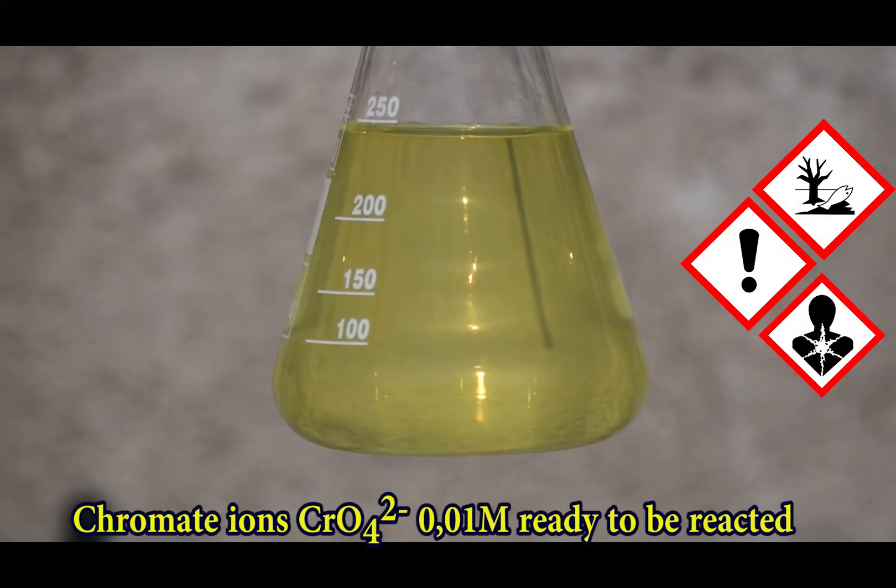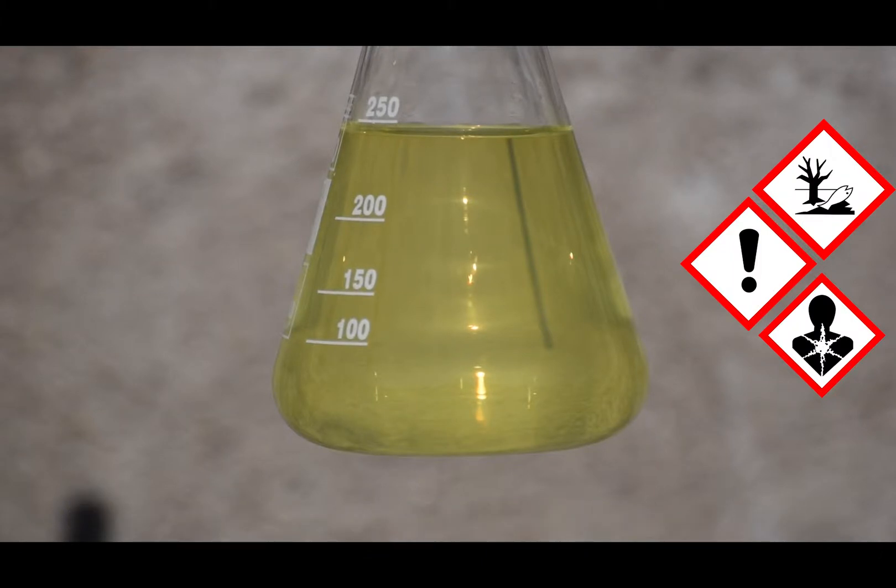It's enough to have a small concentration of chromate — for instance, 0.01 molar or 10 mmolar — to observe dramatic changes when silver ions are added.